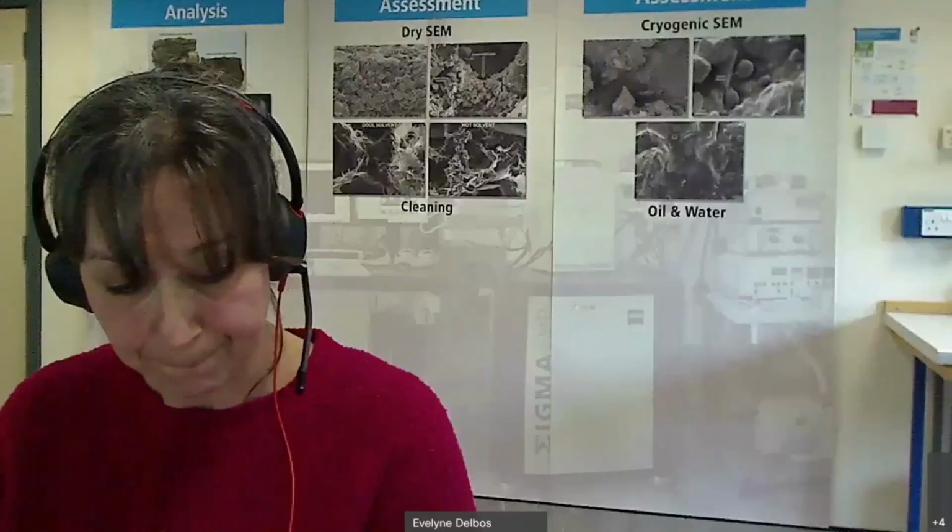Okay, thanks, Evelyne. I think we've probably got time for one more question, and then perhaps we need to wrap up. This is a question for Steve. Can you use XRD to do quantitative analysis of corrosion products? Yeah, the answer would be yes. Again, it depends very much on the amount of sample material that you have. That might limit your sample preparation and then what techniques you could use.